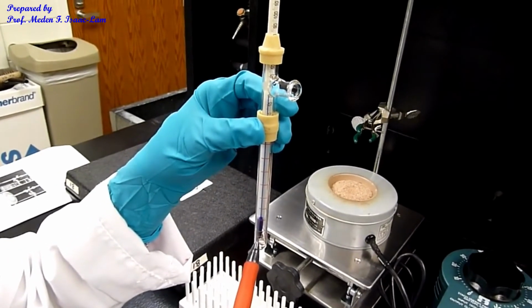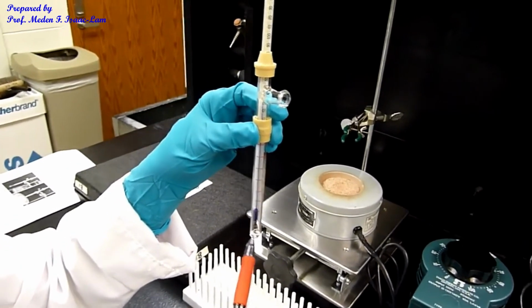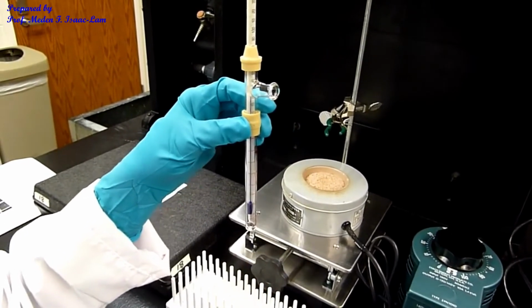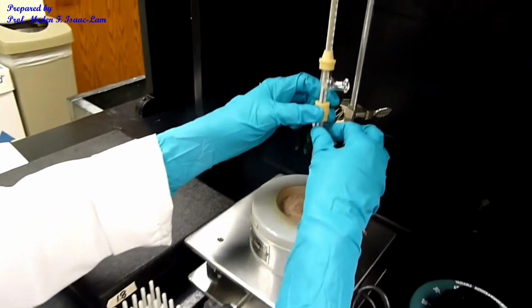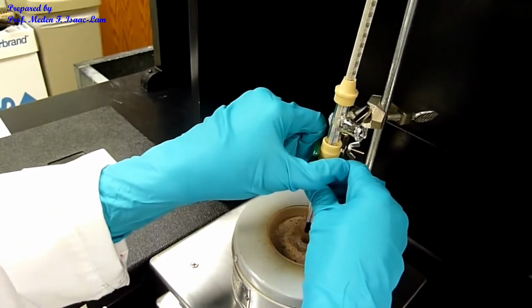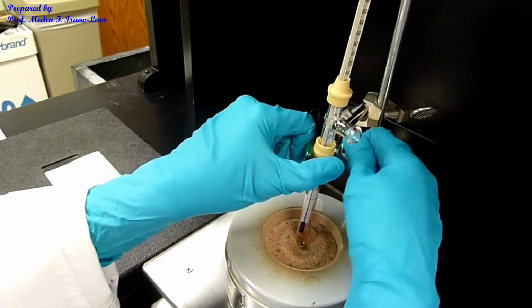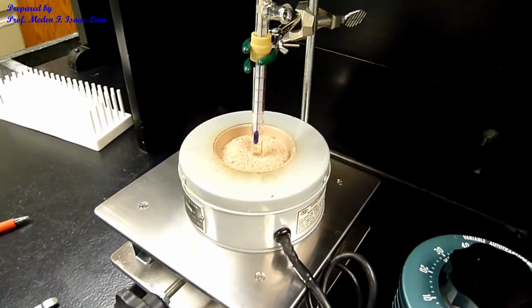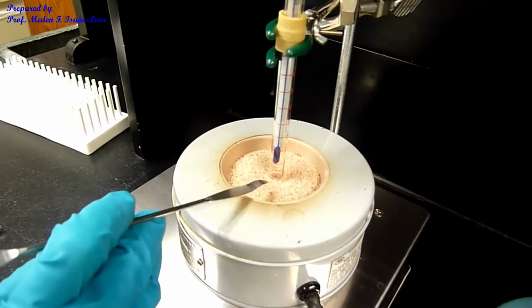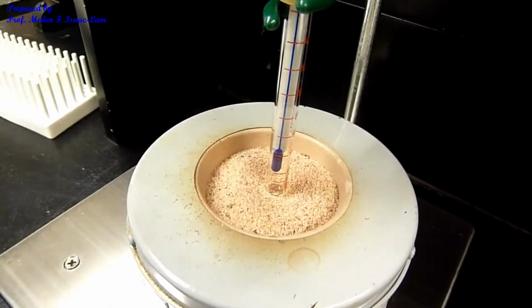When it boils, I'm measuring the temperature of the liquid, and it's touching the bulb in here. So I'm going to put it now in the sand bath and clamp it. So the setup is I don't want the thermometer to be measuring the sand or the sand bath, so I have it higher than the level of the sand bath.